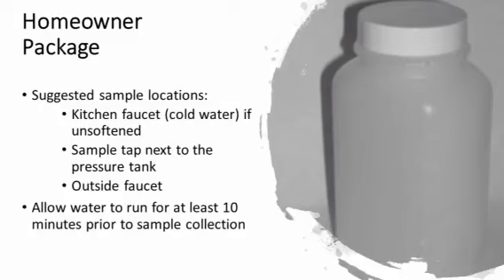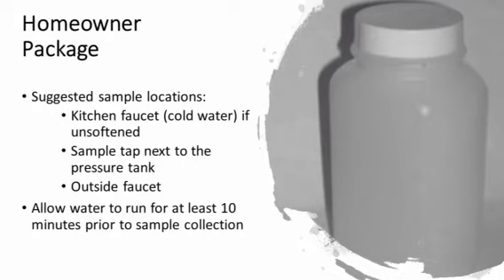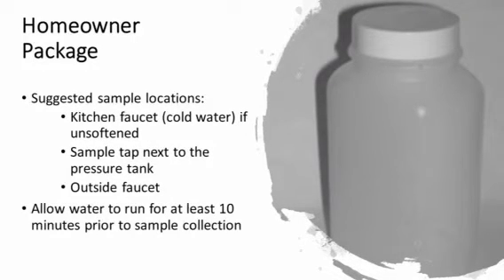When sampling for the homeowner's package, you will be using the large bottle with the white cap. This is a sterile bottle that should not be opened until you are ready to collect your sample. Choose a faucet that is untreated. Whichever faucet you choose, make sure that you run the water sufficiently to flush stagnant water from the water system. Flushing the water for at least 10 minutes or until it gets as cold as possible will generally ensure that you are collecting water directly from the well.